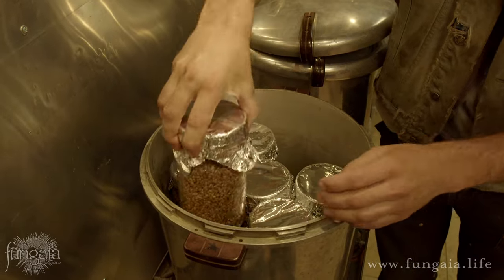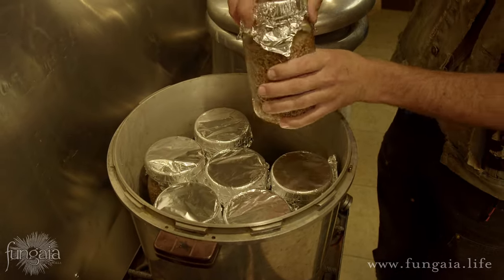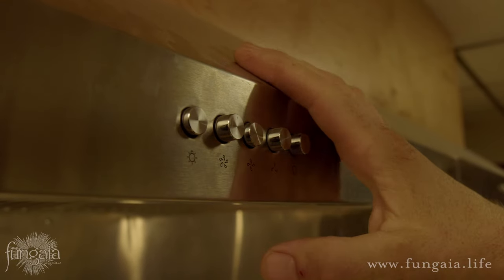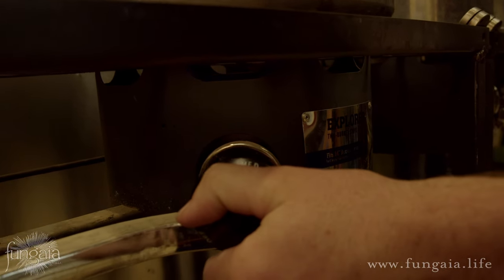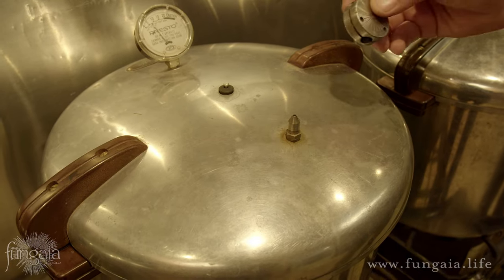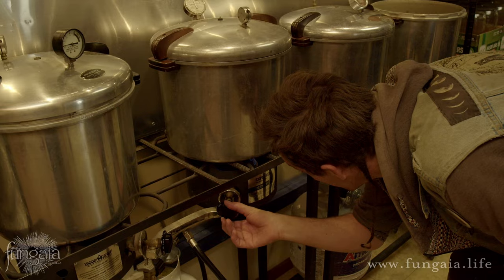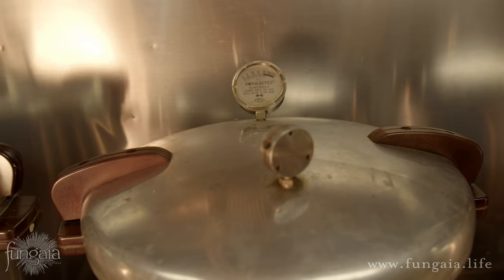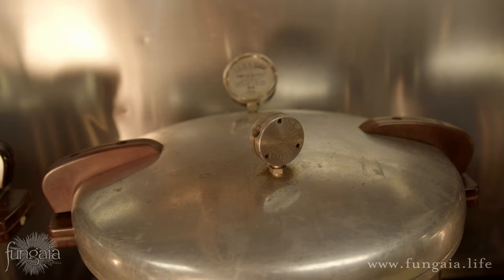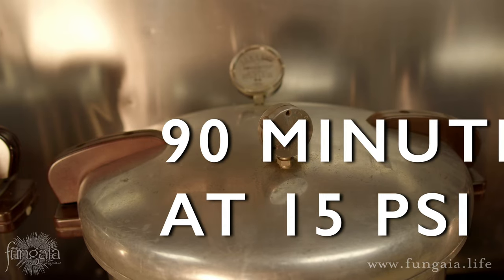As you load the jars, double-check to make sure the lids are still loose. Heat the pressure cooker on high until it's releasing a steady jet of steam — this usually takes about 15 to 20 minutes. Add the shaker weight on the 15 PSI setting and bring the cooker to full pressure. Turn it down and try to find the sweet spot where it maintains pressure but only rattles and releases steam intermittently.